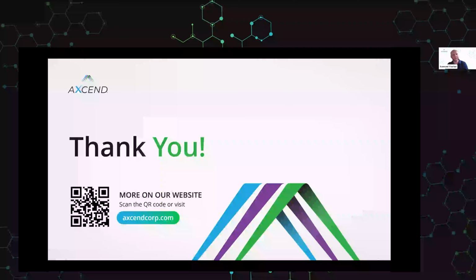See another question here. Where can we use electrokinetic pumps? So electrokinetic pumps can be used pretty much anywhere. I mean, they use them in satellites. I've seen any number of different applications. They are incredibly useful, but they do come with the caveat that they take a lot of additional testing and validation in order to make sure that you're properly generating the flows and the pressures that you think you are.